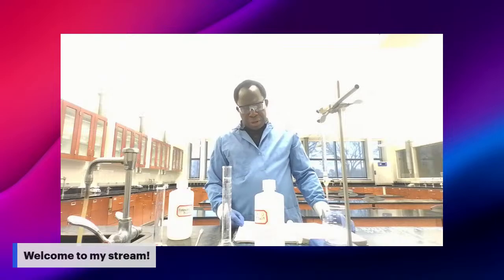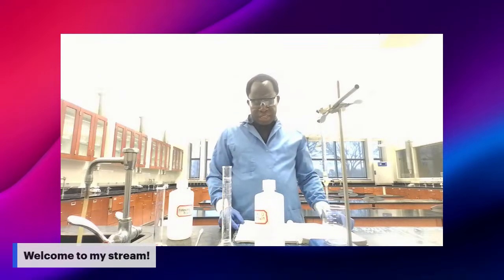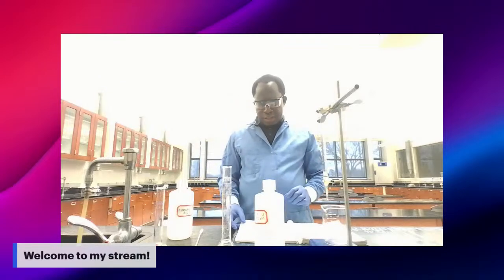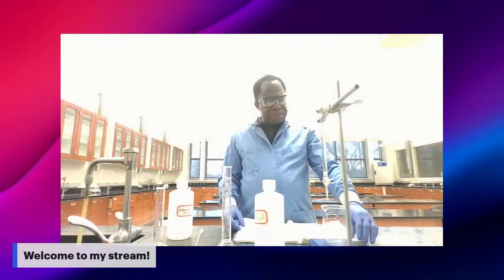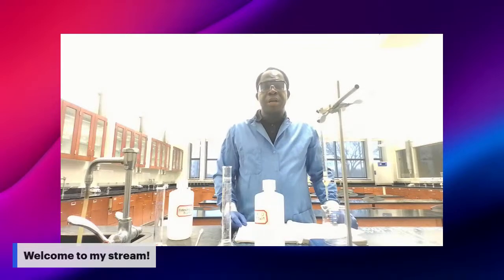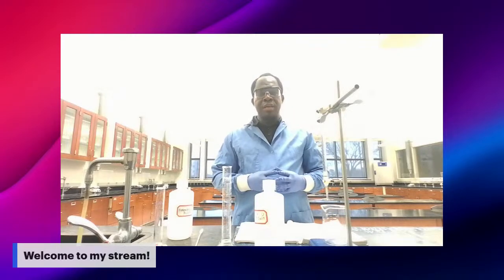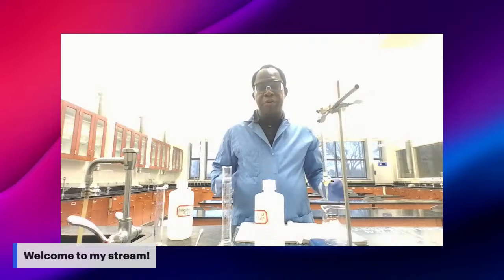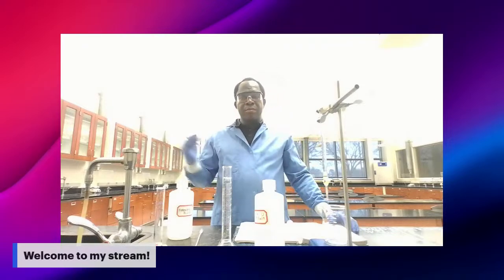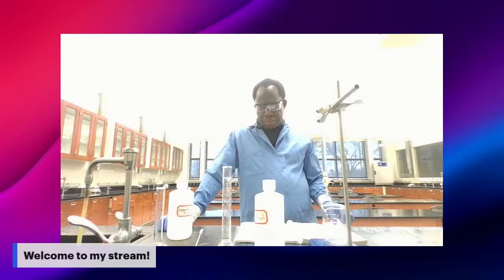Actually, you need to perform 3 titrations. This is what the book is recommending you to do. But your instructor will determine how many titrations you have to perform in your lab. It can be 1 titration, can be 2, or it can be the 3 titrations the book is mentioning here.